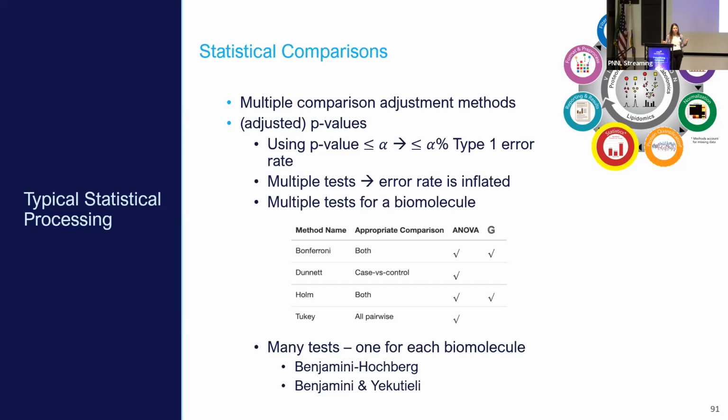So when we're thinking about p-value cutoffs, and we say that we want to call something significant if its p-value is smaller than 0.05, say, what that means is that we have a 5% false positive rate. So we're willing to say, I'm okay if 5% of what I'm seeing as significant is just by chance, and everything else is not. We're not going to know which are the 5% in our results, but that's sort of the typical cutoff that you probably see all over the place.